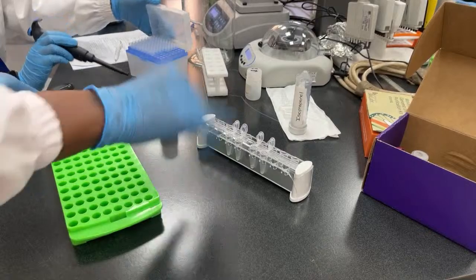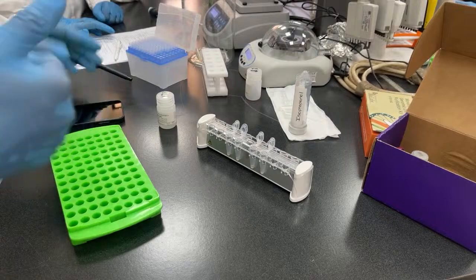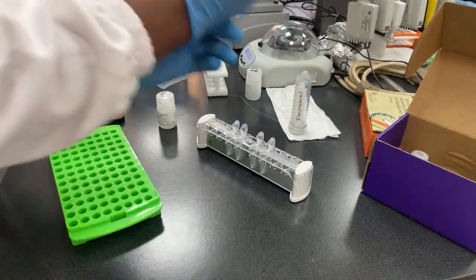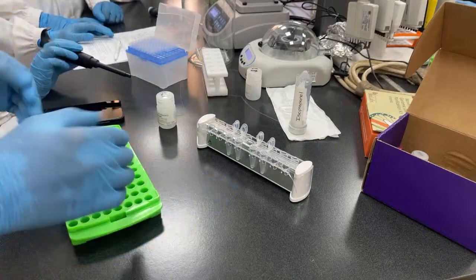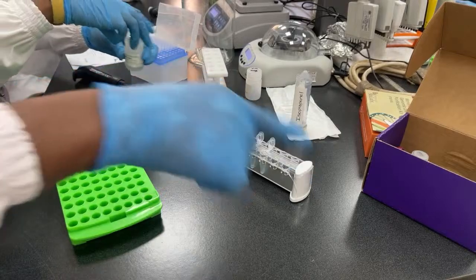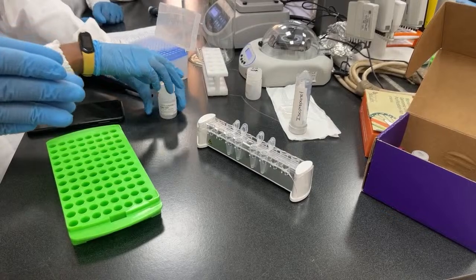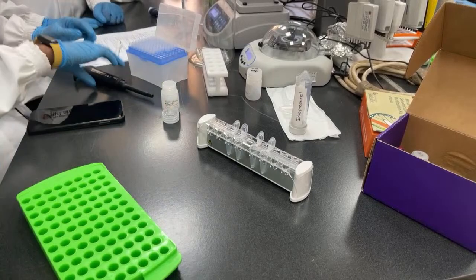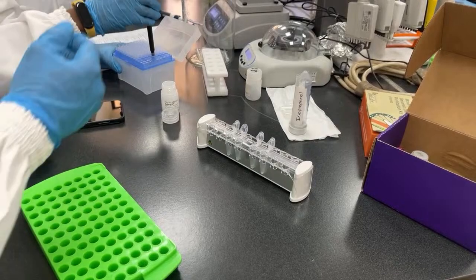Okay, I just wanted to take out the supernatant first. You're going to have to remove all of it, and now you're doing the washes. So you just add 500 nicely, slowly. I just wanted to remove that first bit for you guys, and I'm going to need one person to remove the remaining supernatant, or to do the washes, to add the 500 microliters. So who's confident? Yes. Okay, there you go. Don't touch the disc, please.